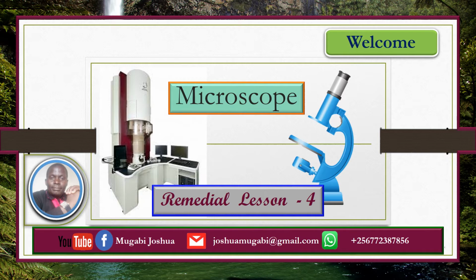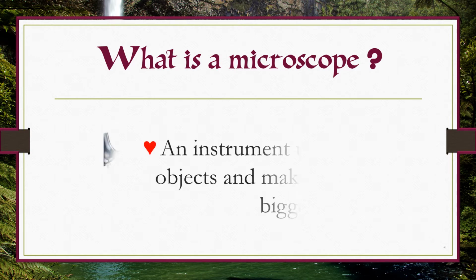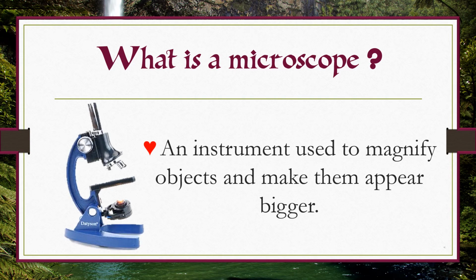Today we are on Remedial Lesson Part 4, where we are going to talk about microscopes. What is a microscope? A microscope is an instrument used to magnify objects and make them appear bigger.